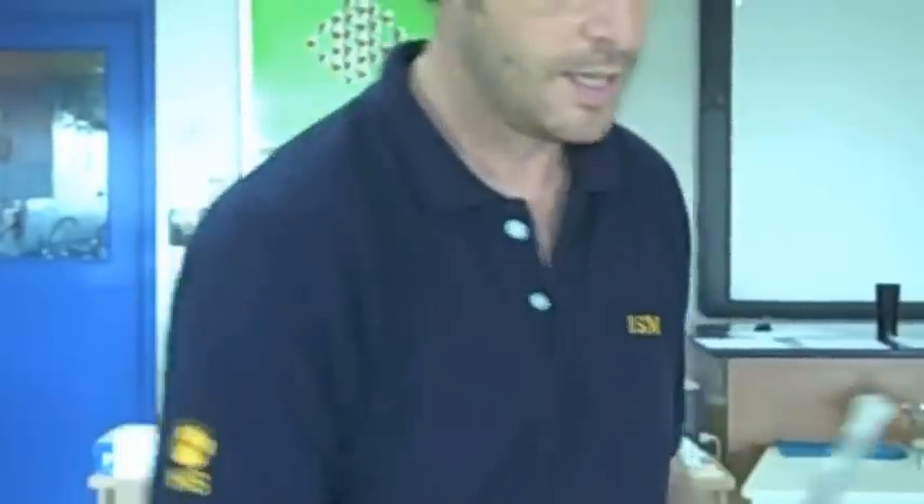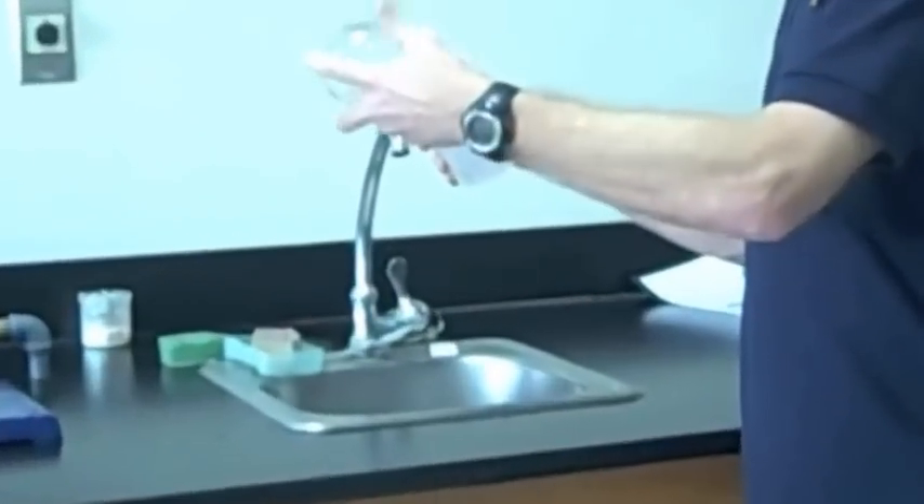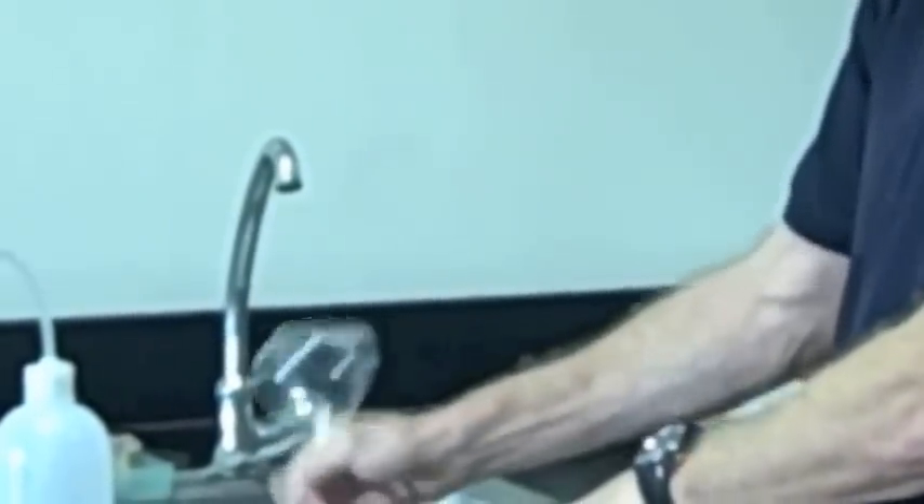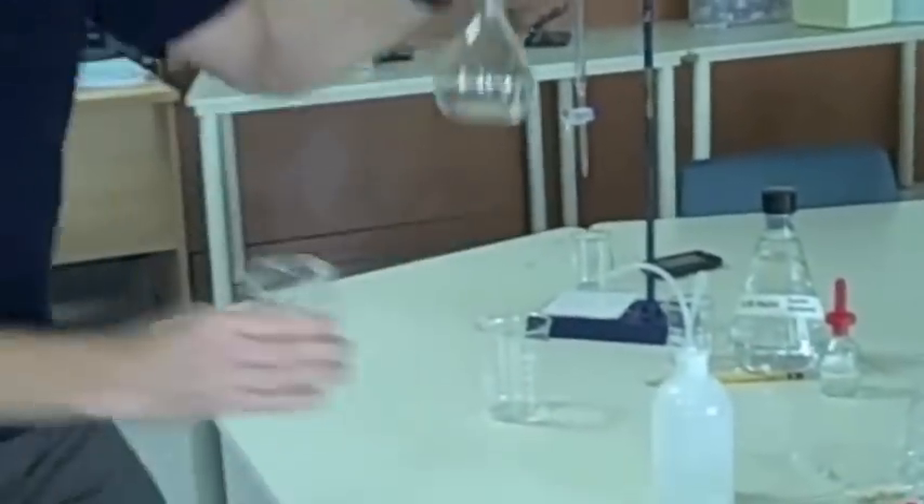We should have cleaned the funnel with three or four rinses of tap water, and then rinsed it out with distilled water. We don't need to fill it with distilled water — we rinse it out, make sure we've coated every surface, and then let that out. Remember, it doesn't need to be dry because it's going to be mostly water. So then hold the funnel up — don't let it sit down, otherwise you end up spilling. Hold it up a little bit and then pour your solution in.